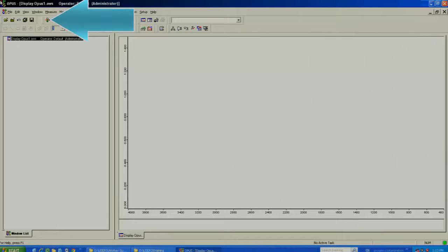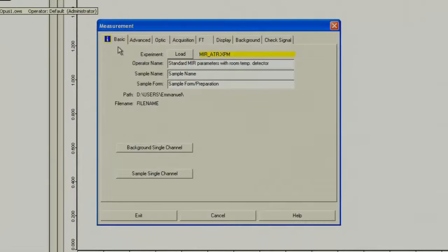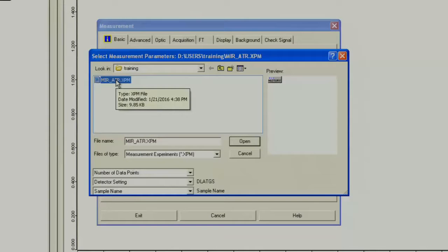You want to check that the system is working properly, so click on the test tube icon. This is where you will do everything. The basic tab is where you will load your experiment. So click load and then select your experiment. During training, it will be added to your personal folder. Then click open.